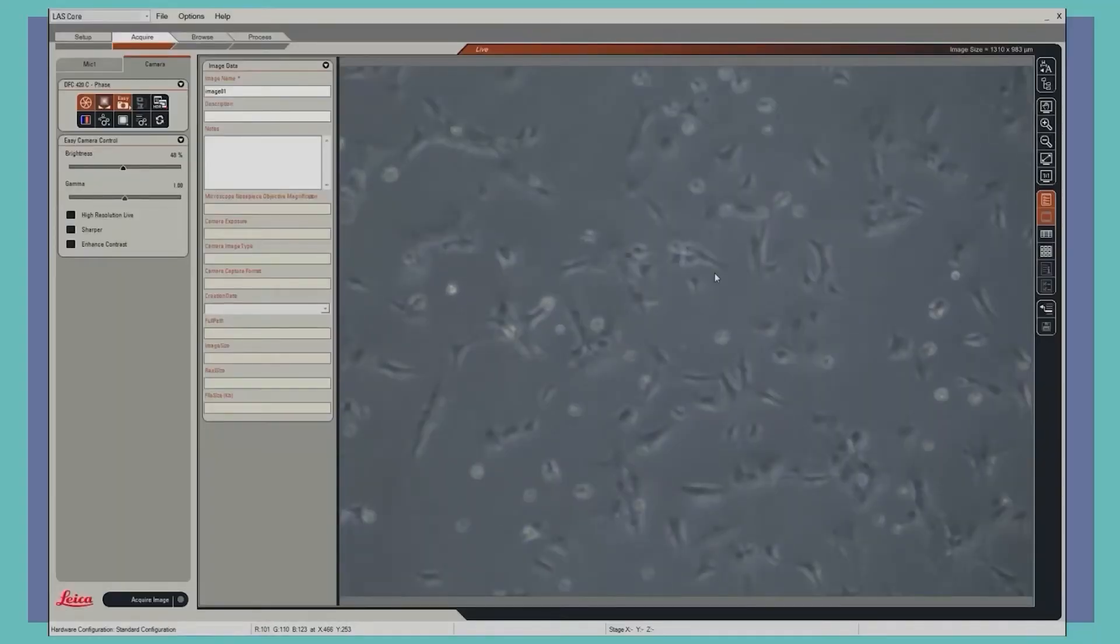This is what the live cell feed from the tissue culture microscope camera looks like on a computer. Here we can clearly see an evenly distributed population of cells from our flask.